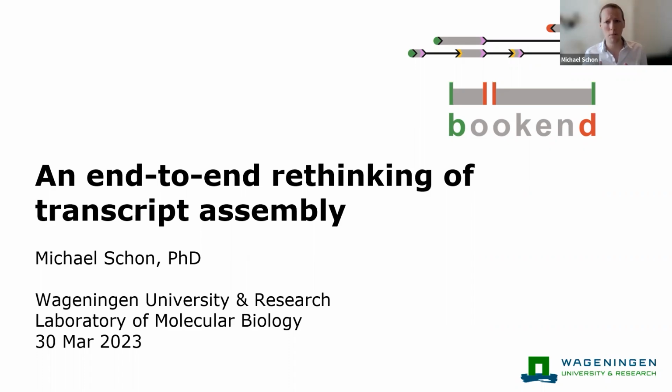First, I'd like to talk about how we got to the present day, sort of RNA sequencing technologies up to now, and then I'd like to introduce my own software package I've been developing and sort of the ideas behind it and how it performs. So here is an end-to-end rethinking of transcript assembly.